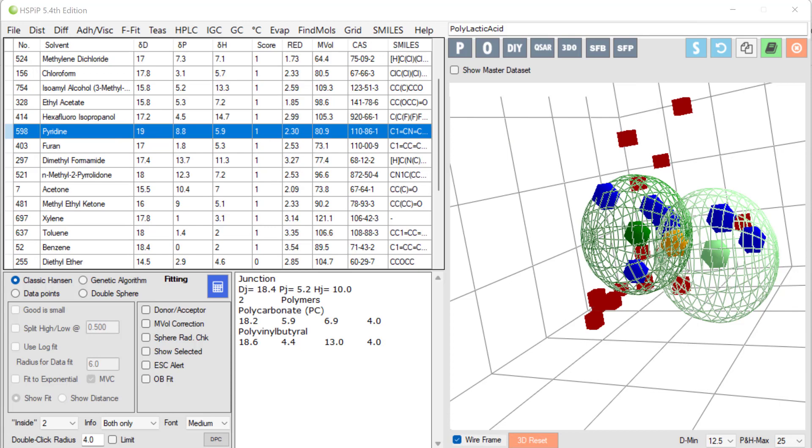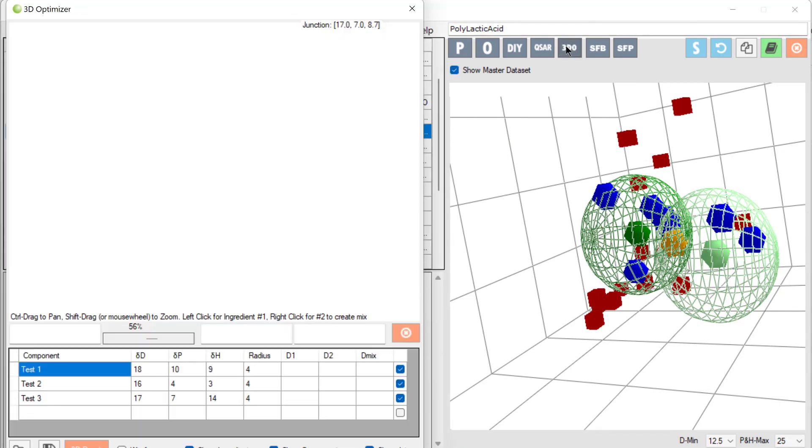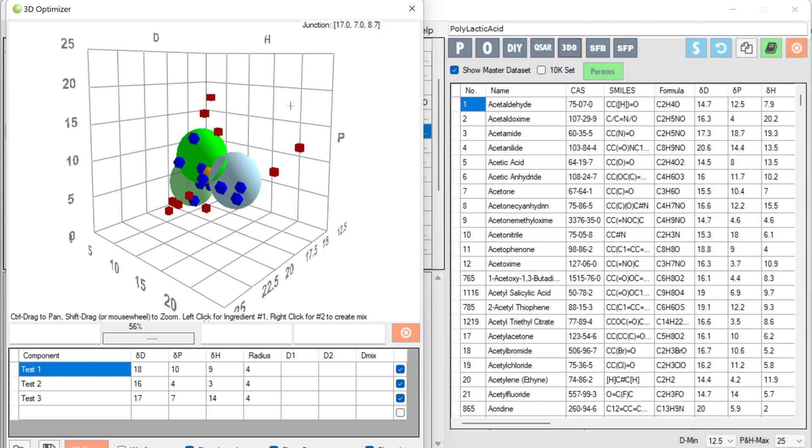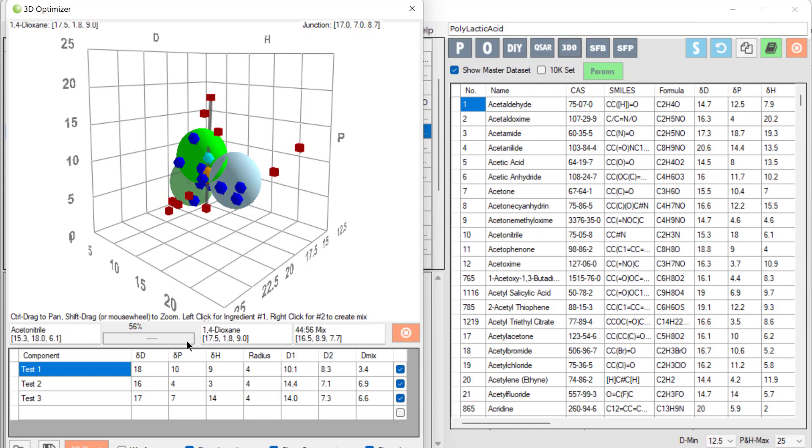There's an advanced option for this complex optimization called the 3D optimizer. Here we have three polymers we want to optimize. And we can do clever things like making solvent blends and changing the ratio of those blends and seeing the distances. All this will make much more sense when we understand solvent optimization. I'm just showing that there is another possibility for doing complex optimizations.